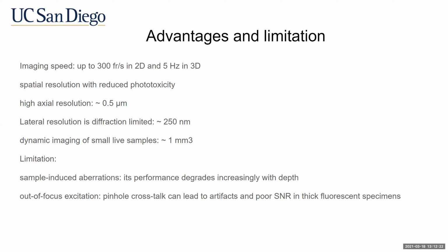Limitation: its performance degrades with increasing depth because of sample-induced aberration. And pinhole crosstalk can lead to artifacts and poor SNR in thick fluorescent specimens because of out of focus excitation.